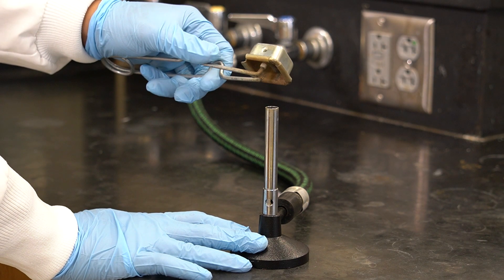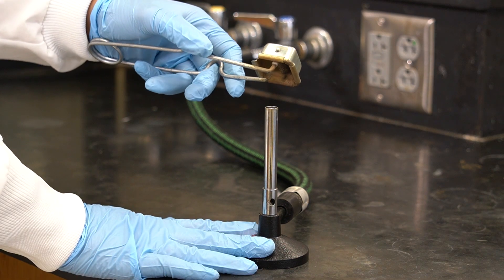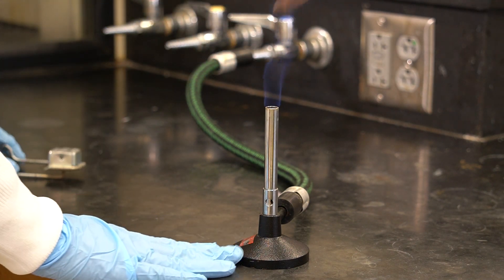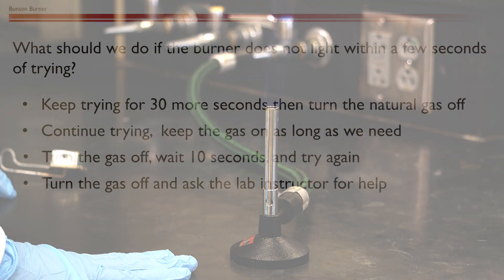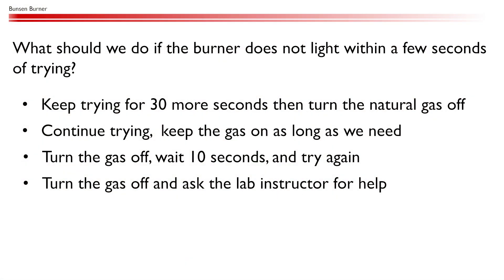Take the striker and place it over the barrel's opening. Strike to create sparks. It may take 4 to 5 sparks to ignite the flame. What should we do if the burner does not light within a few seconds of trying?